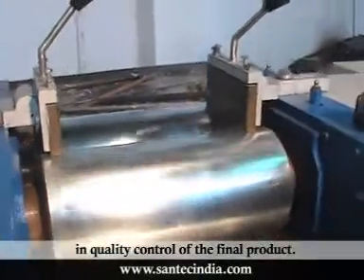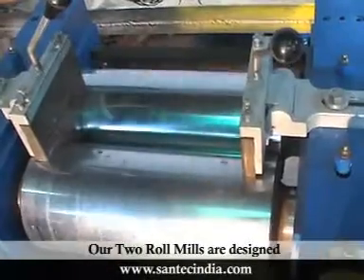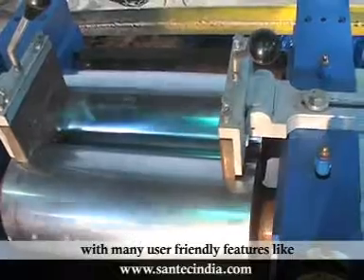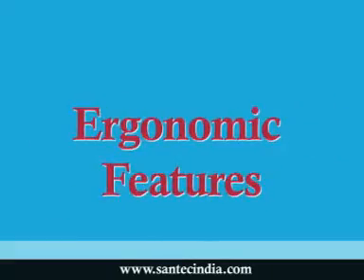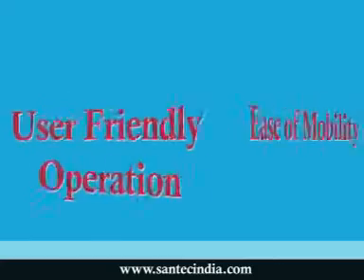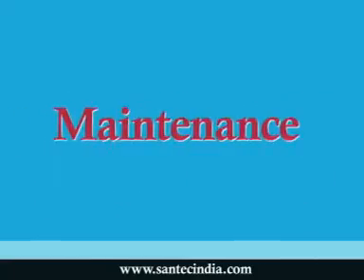in quality control of the final product. Our two roll mills are designed with many user-friendly features like durability, compactness, ergonomic features, ease of mobility, user-friendly operation and maintenance, and economy.